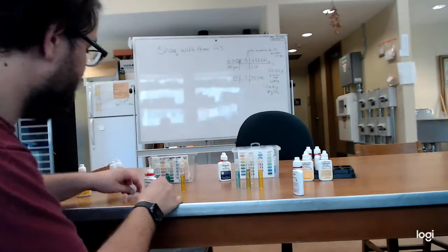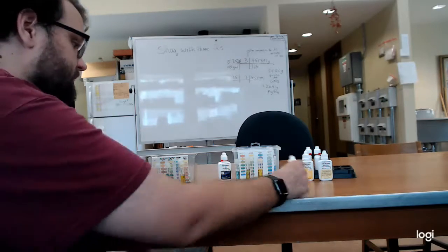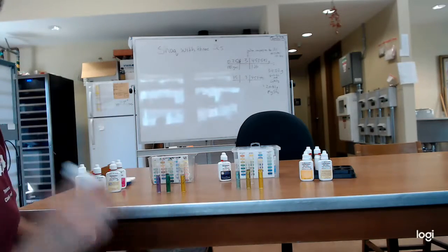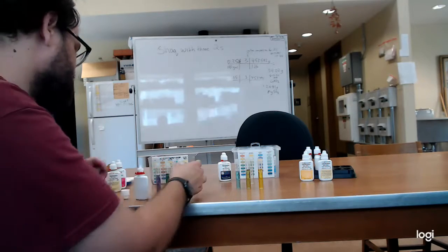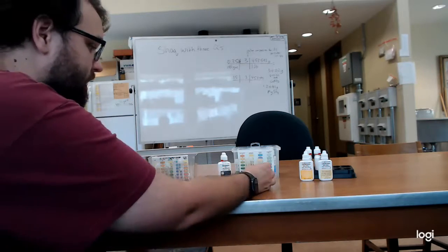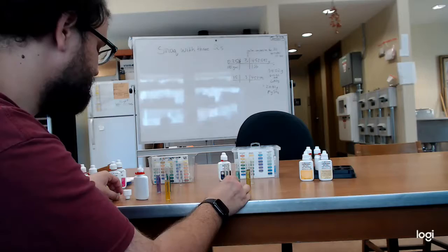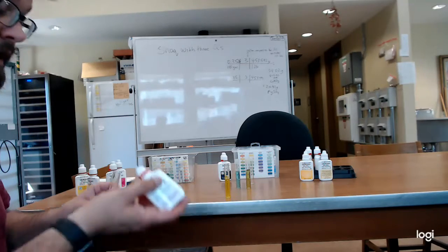As you can see, we're already getting some color differences between these. So you can tell that there's obviously a chemical difference between the compost teas and the regular nutrient brews, or some people call them synthetic nutrient brews, salt nutrients. There's a couple different words depending on exactly how you apply them and where you source them from.